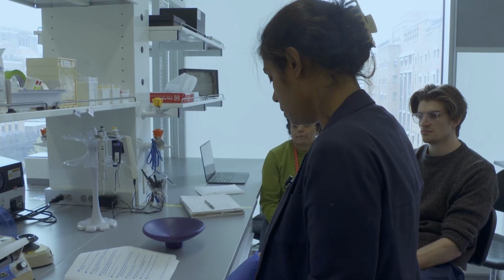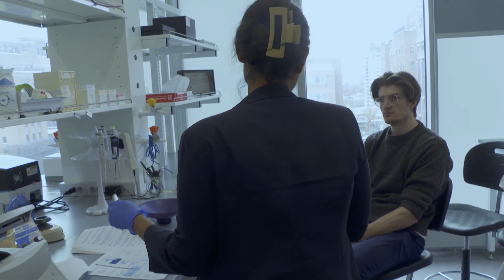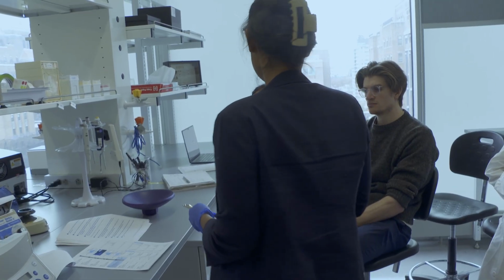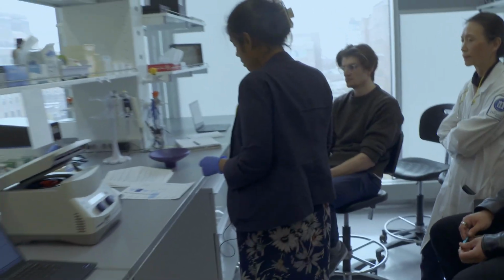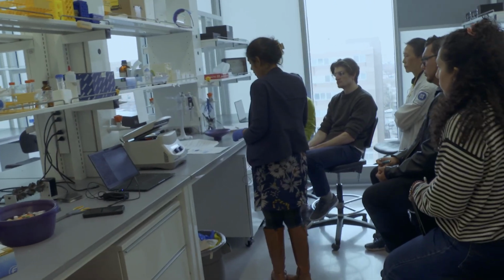And if the number of molecules of the gDNA is more than our actual nucleosome peak, then definitely it will get some reads. So this is loading, right?